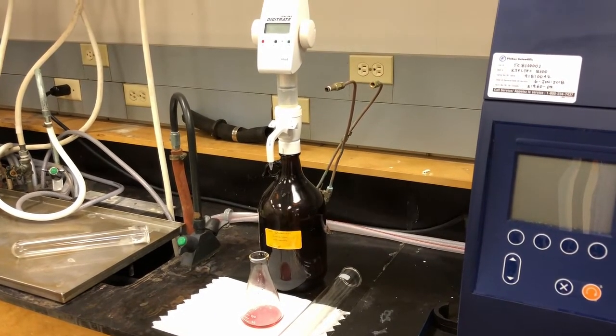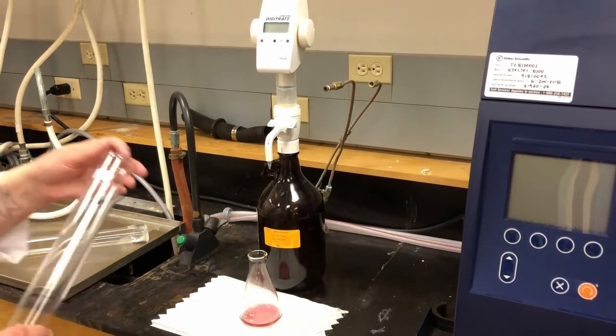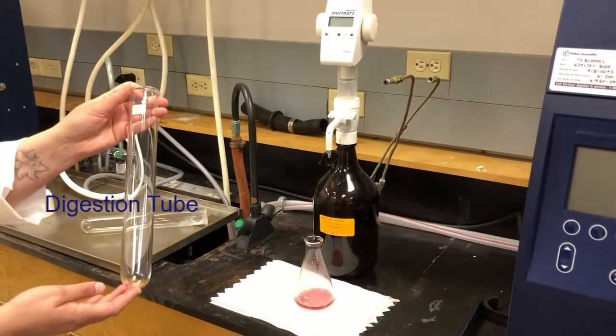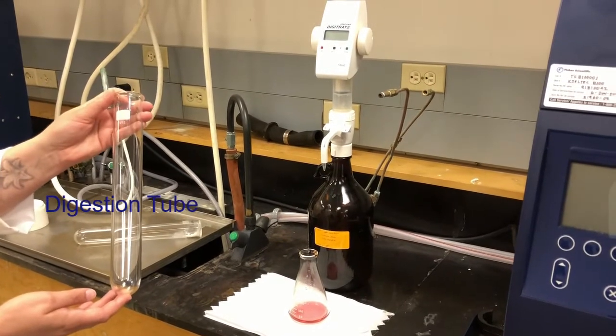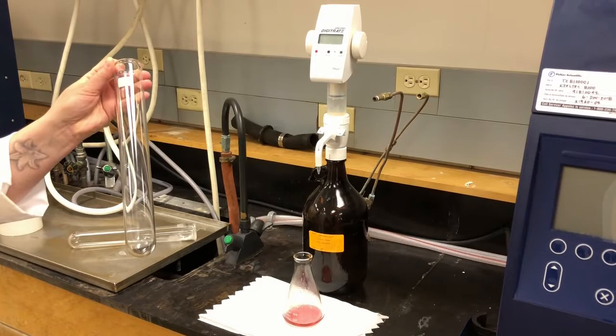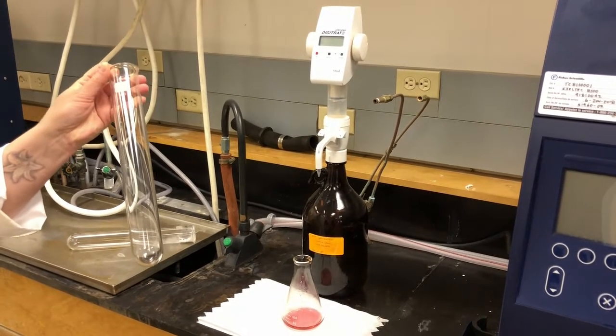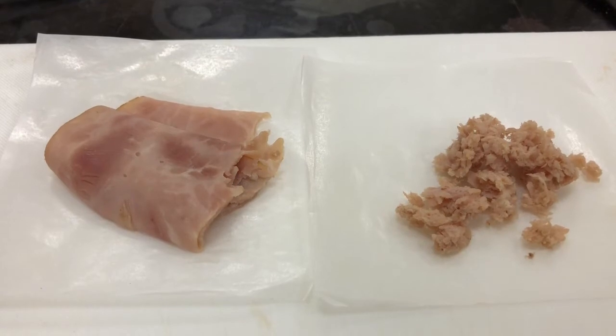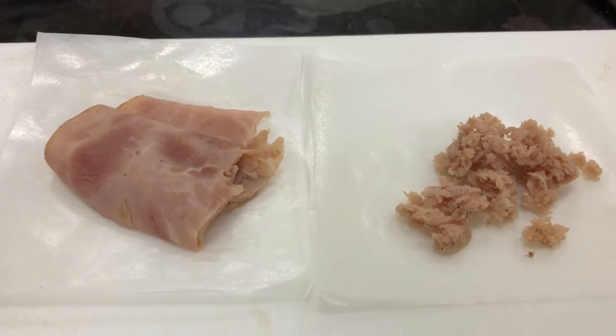So we're going to start with our samples. This is the digestion tube that we put our sample in, that we add the sulfuric acid and the catalyst to. It's basically just a large test tube. We're going to start by measuring out our sample into the tube. Since we're doing a protein lab, for our samples we're going to use meat products.